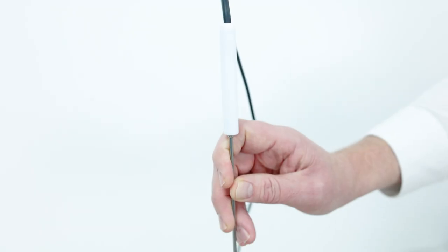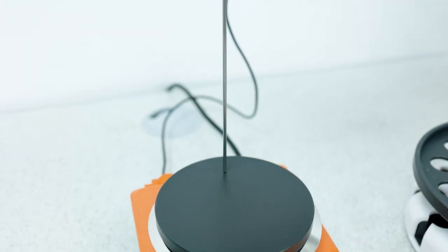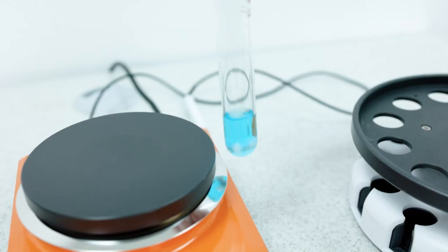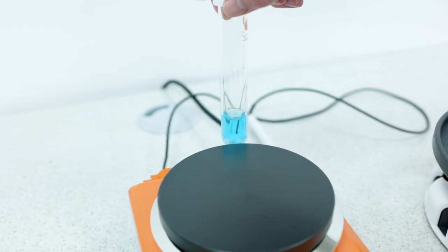For increased accuracy and temperature control, we also have an external PT1000 temperature probe. The Carousel 12 Plus has a patented design which utilizes a secondary magnetic field to make sure that we have powerful and even stirring in each of the positions.